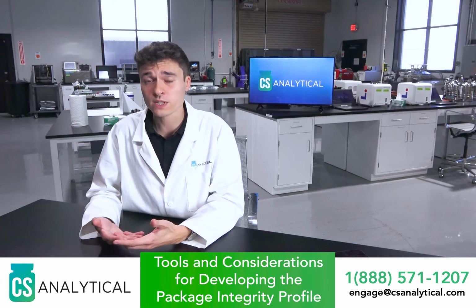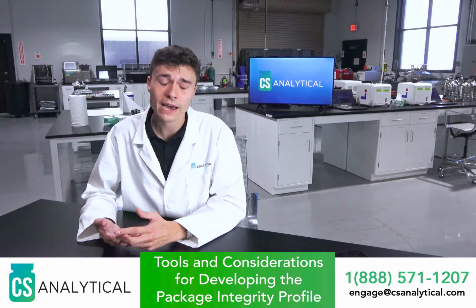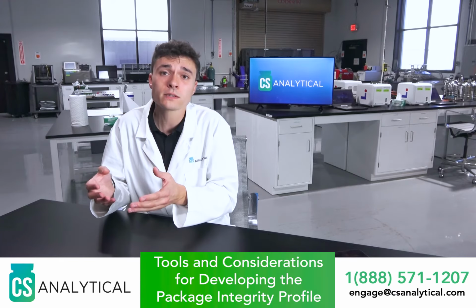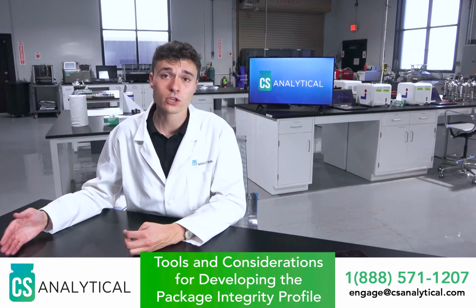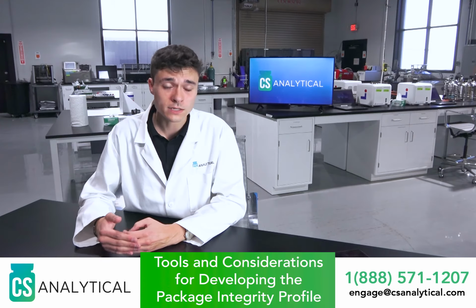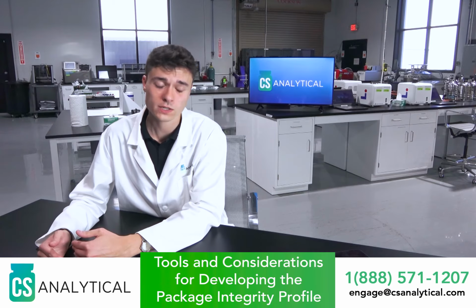Not all of those are necessarily leak tests. If we think about things that can impact leakage, the dimensions of those components are relevant. A dimensional analysis of package components is not necessarily a leak test, but is in support of demonstrating container closure integrity for that product package system.